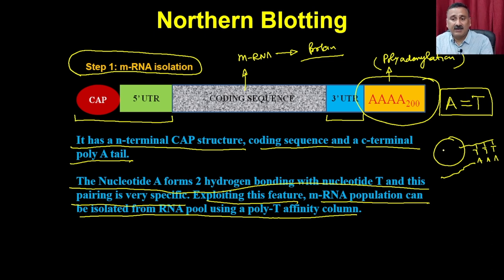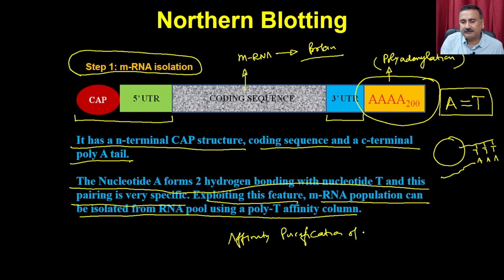Other molecules will not interact with these beads, and that's how they can be washed away. So this method is called the affinity purification of messenger RNA, and it can be done with poly-T agarose beads.